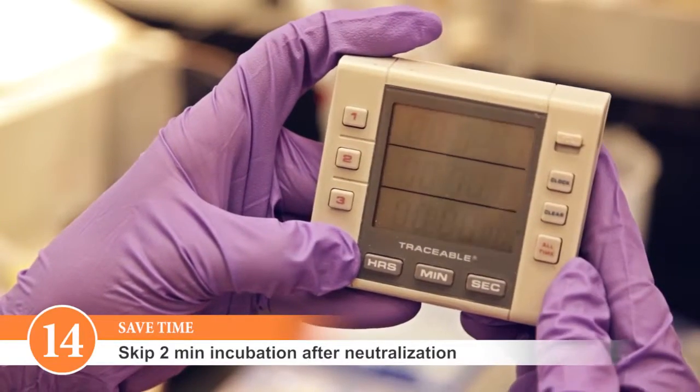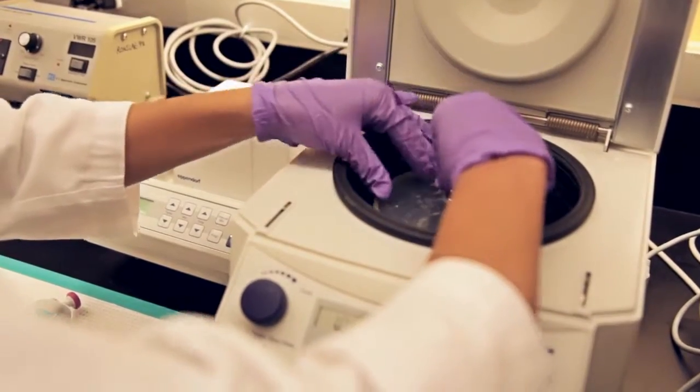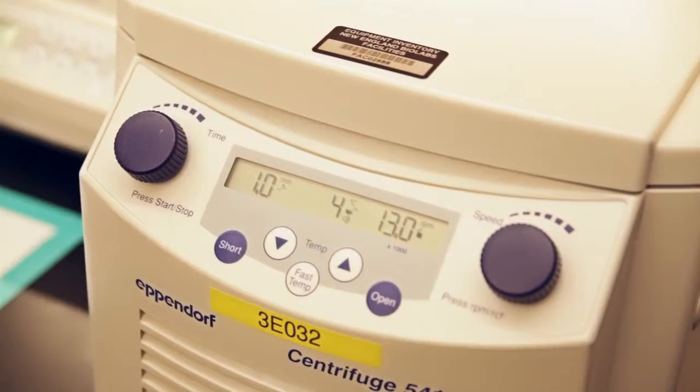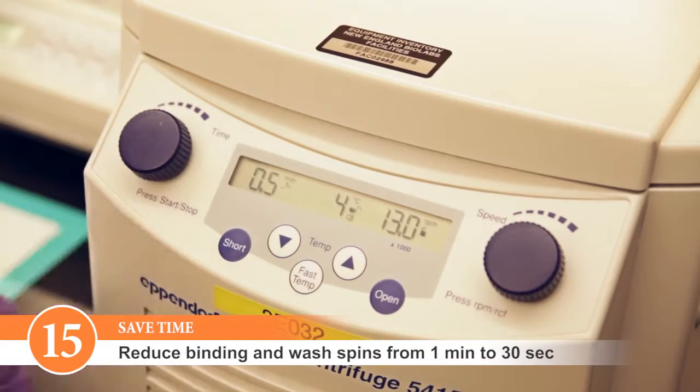You can skip the 2-minute incubation after neutralization if the cell debris pellet is compact enough that it won't be inadvertently transferred to the column. You can also reduce the spin time after neutralization to 2 minutes. After using wash buffer 1 and when binding your sample to the column, you can spin for 30 seconds rather than 1 minute.